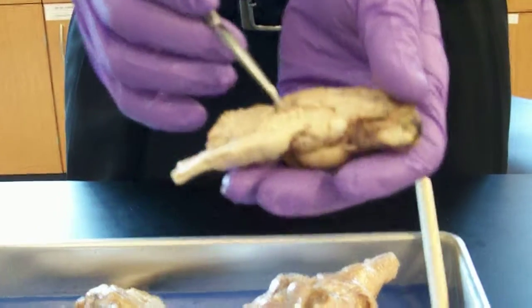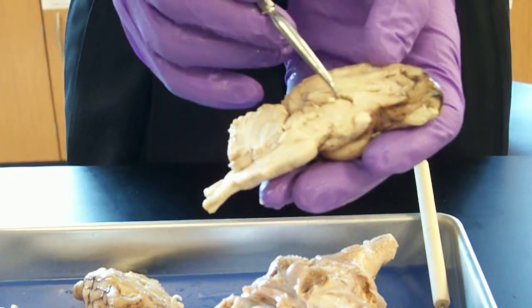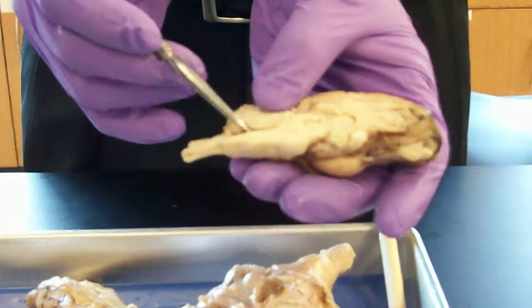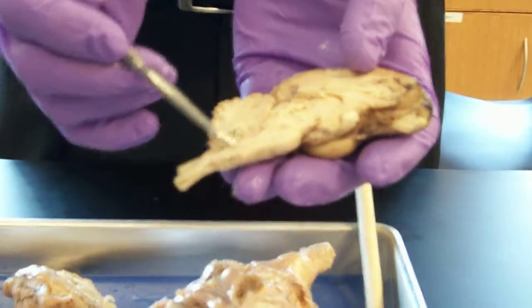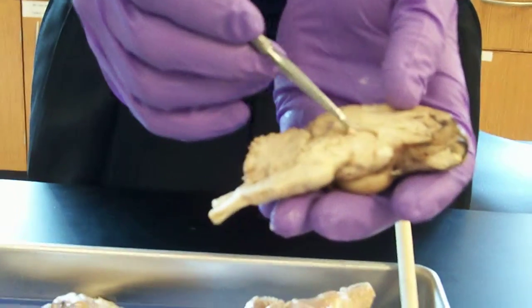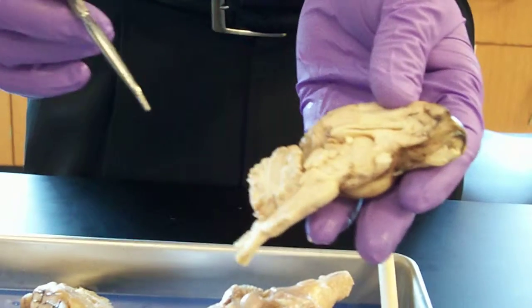We've got a little bit of debris here, but there's a channel that connects this 3rd ventricle all the way down right here, which is the 4th ventricle. The 4th ventricle is between the cerebellum and the medulla oblongata. So 4th ventricle, 3rd ventricle, and then those lateral ventricles are in that corpus callosum.